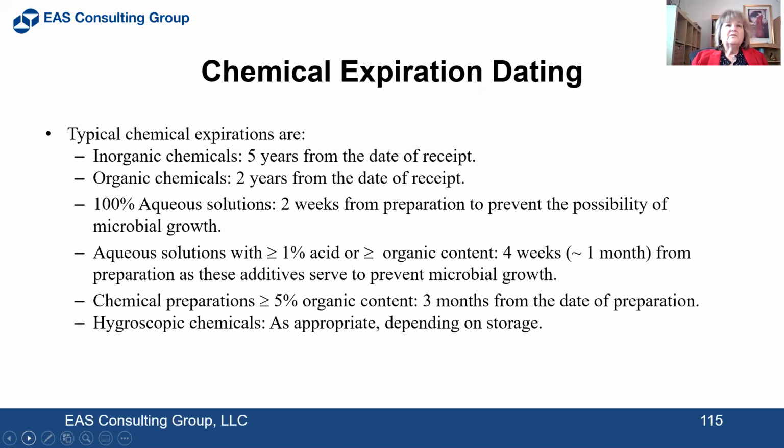Aqueous solutions with greater than 1% acid or organic content, 4 weeks or about a month from preparation, as these additives serve to prevent microbial growth. Chemical preparations with greater than 5% organic content, usually give those 3 months from the date of preparation, and hygroscopic chemicals as appropriate depending on their storage.